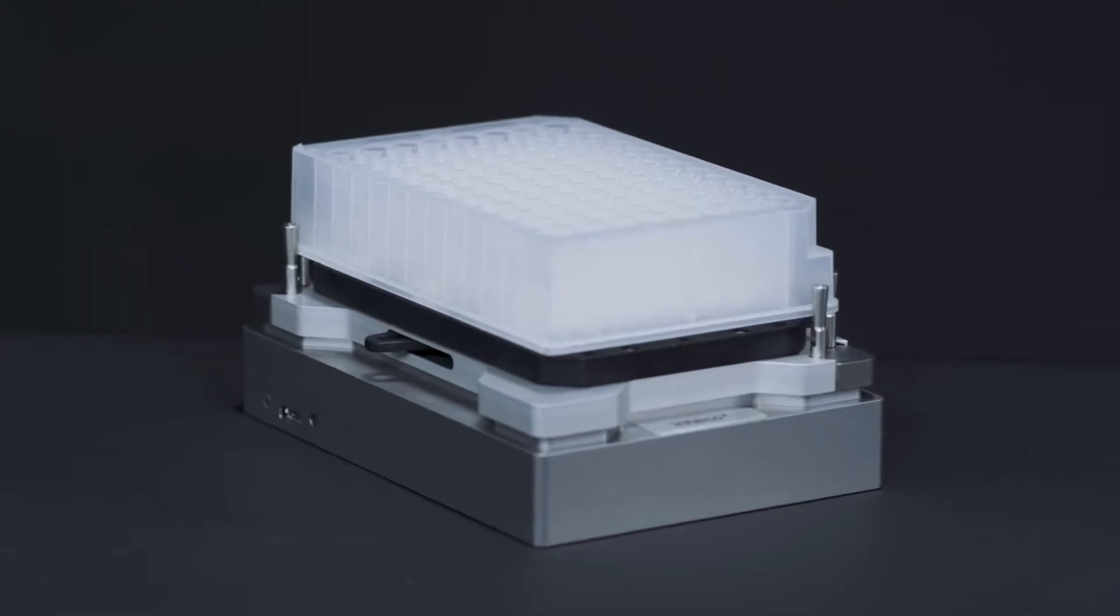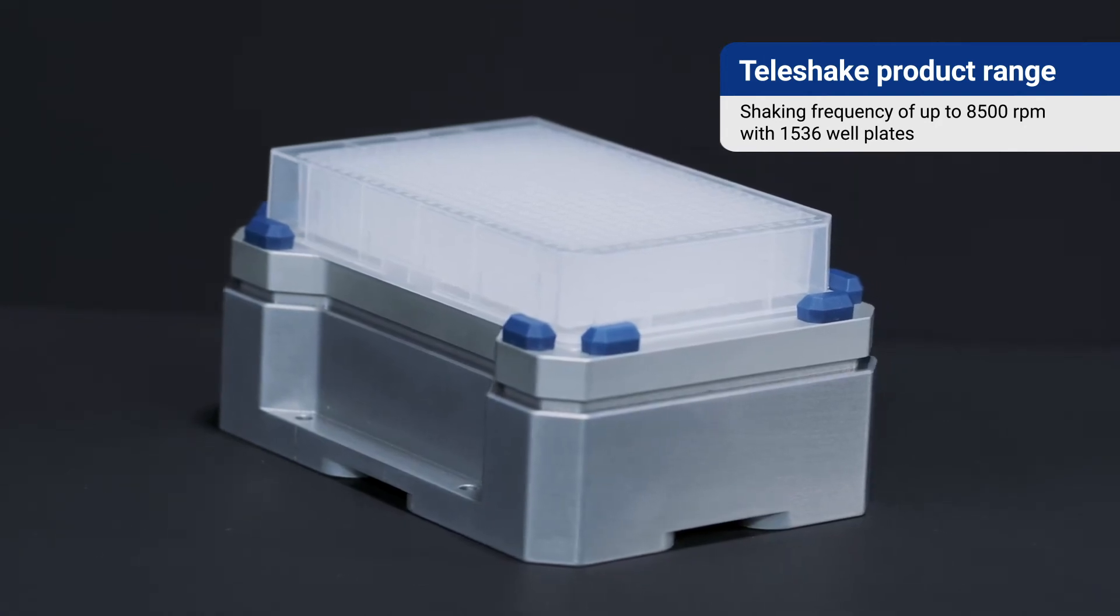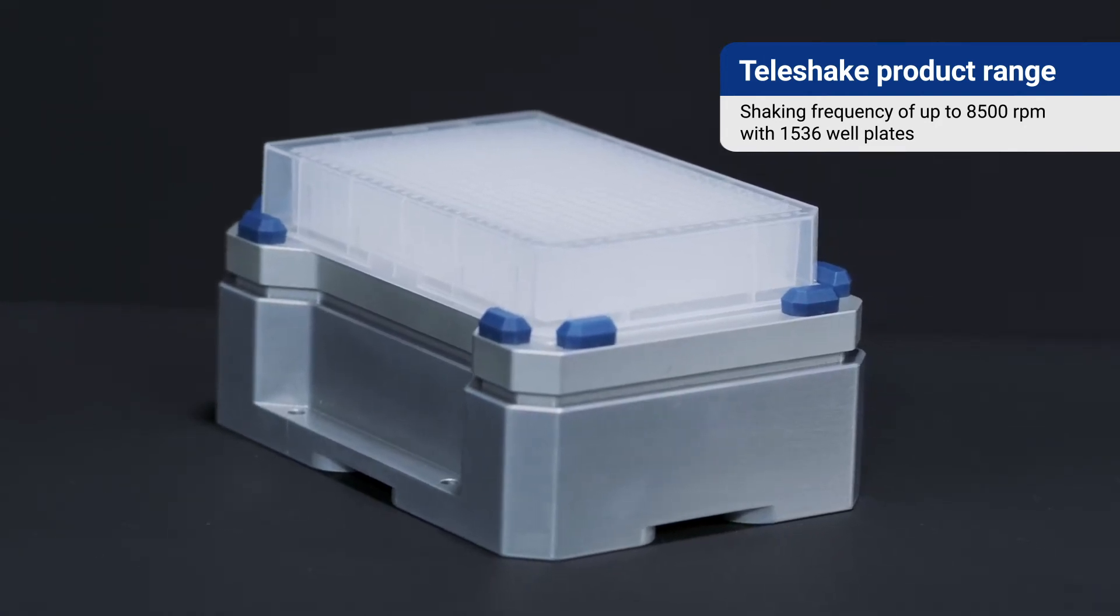Our shakers can also achieve a class-leading shaking frequency of up to 8500 RPM for 1536 well plates.